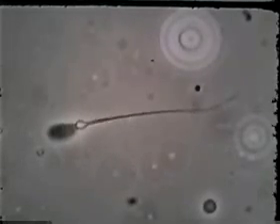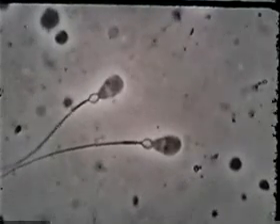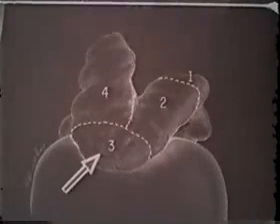This is a segment of one of the ductuli efferentes showing the strong ciliary currents within the tubules. This is quite characteristic of segment 2. But even here, the majority are unable to rotate or to make any forward progress. Segment 3 is the point of flexure of the head of the epididymis.